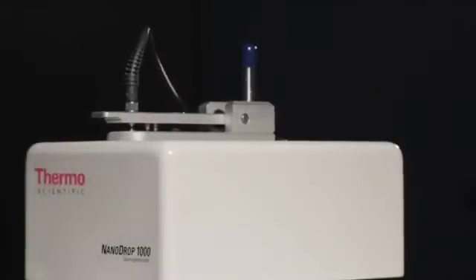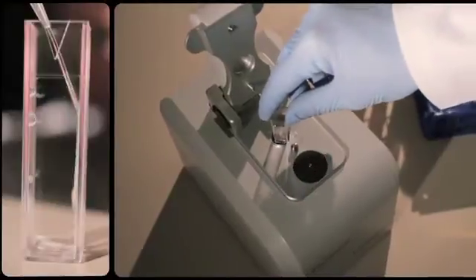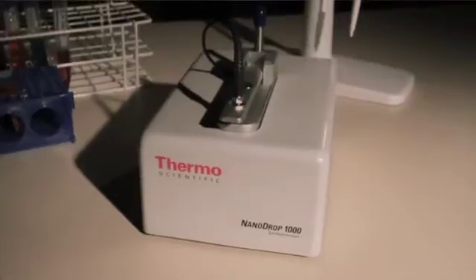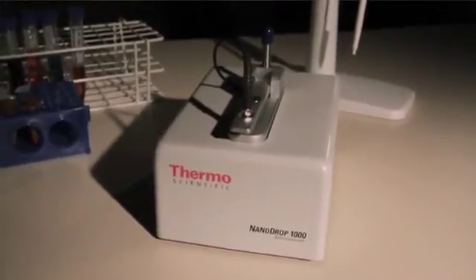Since we've introduced the NanoDrop 2000, I've gotten questions from customers. Well, can I trade my 1000 in for a 2000? They're excited about all of the new features that are in the NanoDrop 2000. Well, now we are offering an opportunity for people to do that. There's an incentive for you to trade your NanoDrop 1000 in for a 2000.